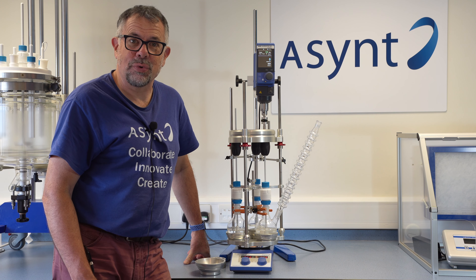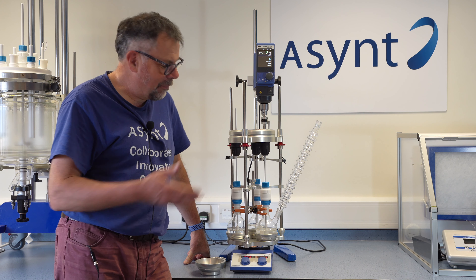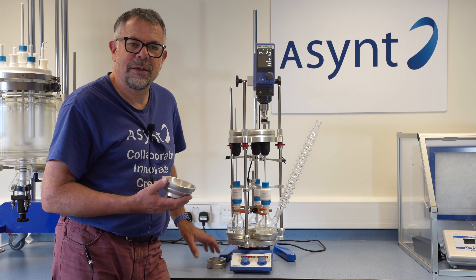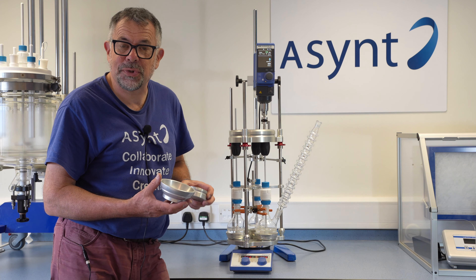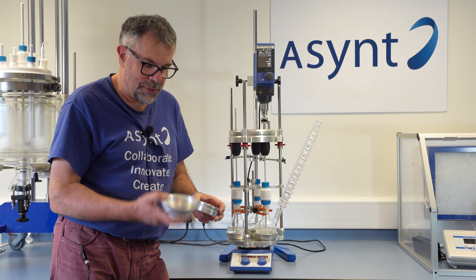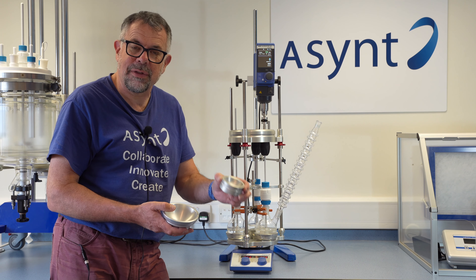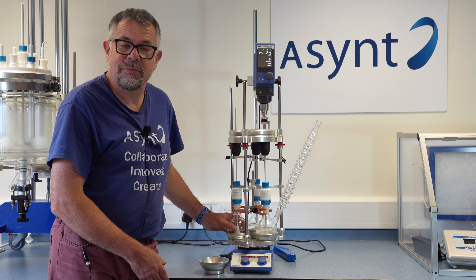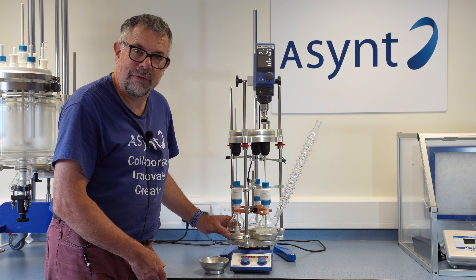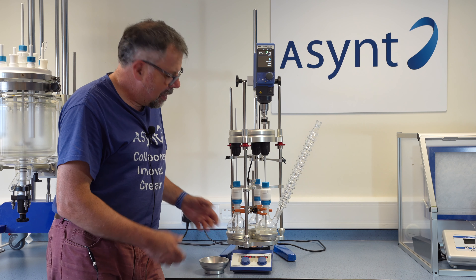Welcome to Ascent. My name is Martin Fordham, and today I'd like to tell you about our Vortex reactor, based on our DrySyn multi inserts — so three round-bottom flasks at a time. Vortex can work with flasks from 100 millilitre size using smaller inserts up to 500 millilitre size. At the moment I have three 250ml flasks in place in standard DrySyn multi 250ml inserts.